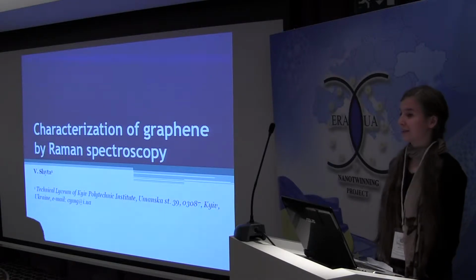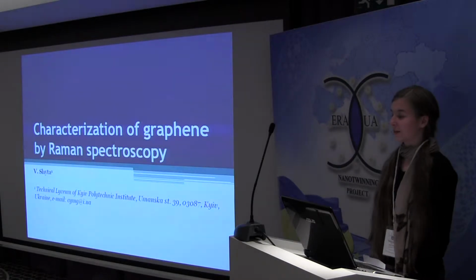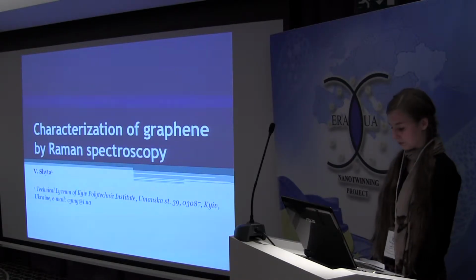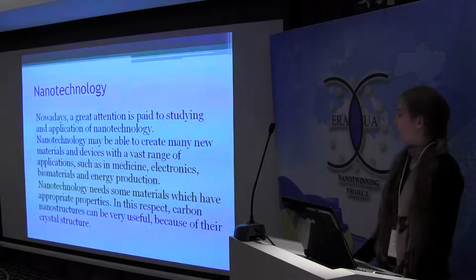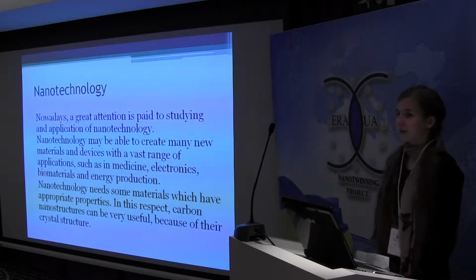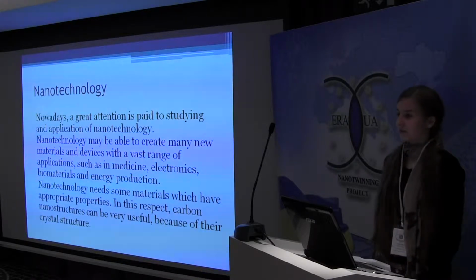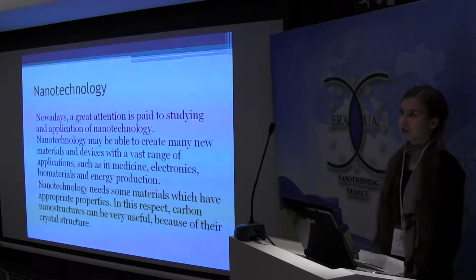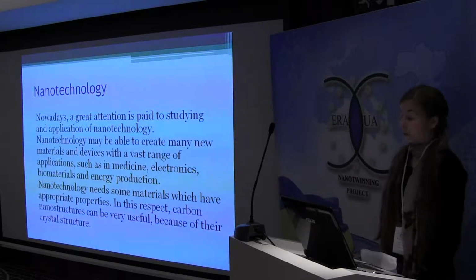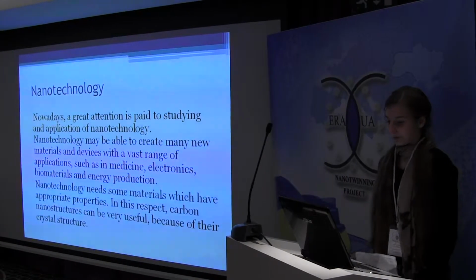I am from the Technical Lyceum of Kyiv Polytechnic Institute, and the topic of my work is Characterization of Graphene by Raman spectroscopy. Nowadays, great attention is paid to the study and application of nanotechnology. Nanotechnology is able to create many new materials and devices with a vast range of applications, such as in medicine, electronics, biomaterials and energy production.